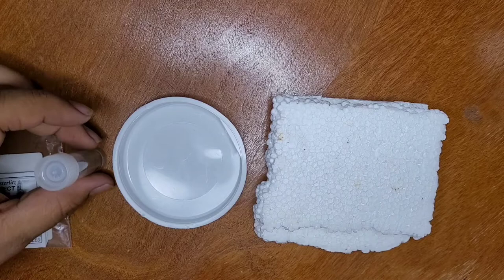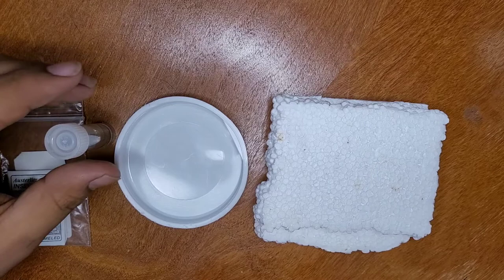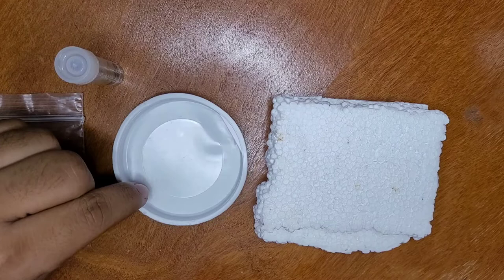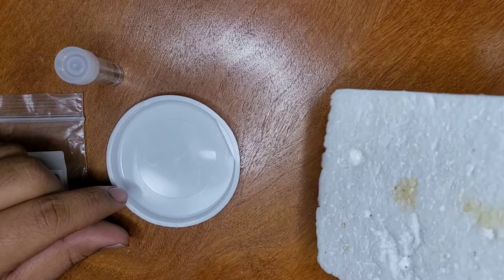Hello everybody and welcome to a new video. Today I am going to be pinning an insect and then identifying it using a dichotomous key. So here we have a tube with a couple of insects inside — I'm going to pour it out into this little lid I have here.